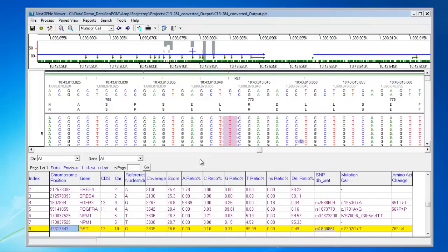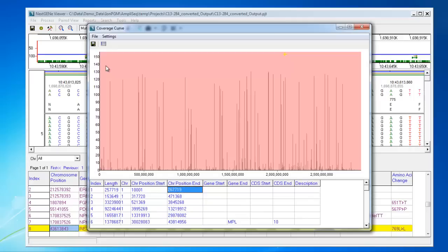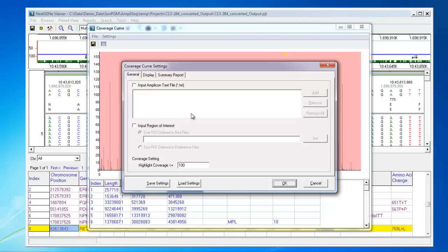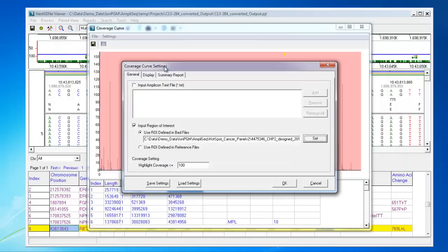Another report that's very useful for AmpliSeq data is the Coverage Curve report, which can be accessed from the Reports menu. This report highlights any low coverage regions. You can open up the settings for this report, and choose to input a region of interest. You can click Set to load the BED file for your targeted regions.